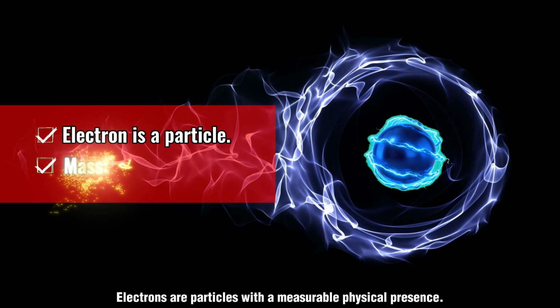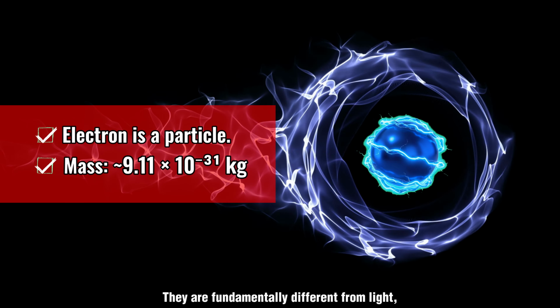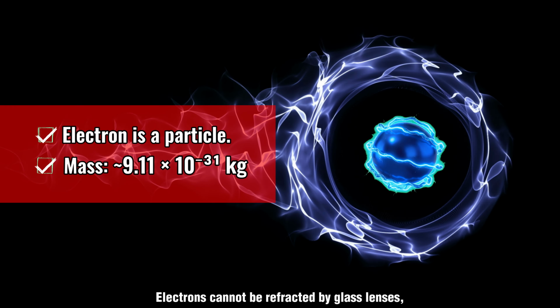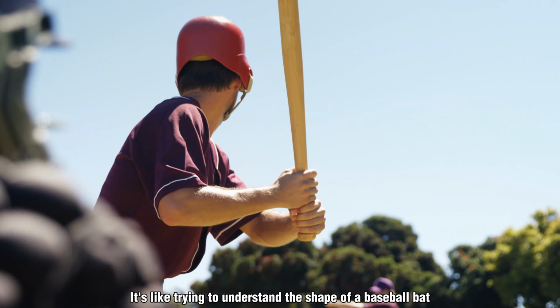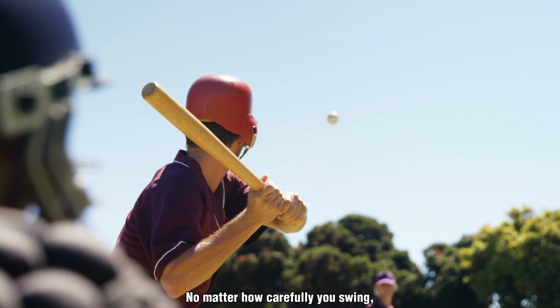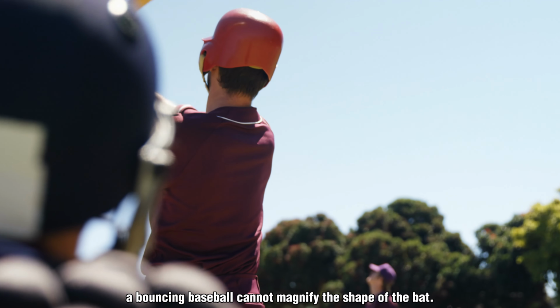Electrons are particles with a measurable physical presence. They have mass. They are fundamentally different from light, which can be described as a flow of energy. Electrons cannot be refracted by glass lenses, nor can they be focused to form an image of an object. It's like trying to understand the shape of a baseball bat by hitting it with a baseball. No matter how carefully you swing, a bouncing baseball cannot magnify the shape of the bat.